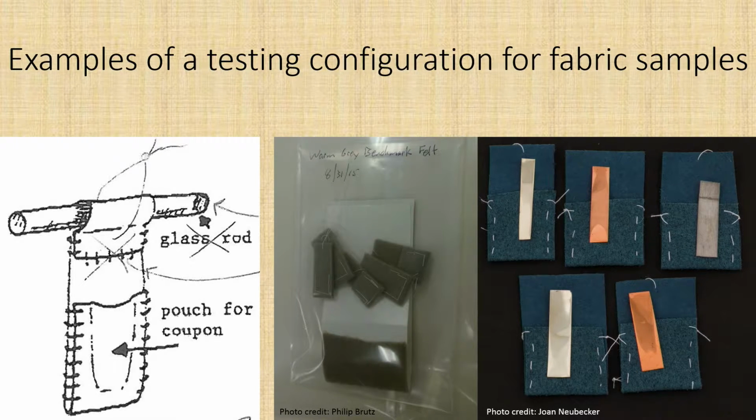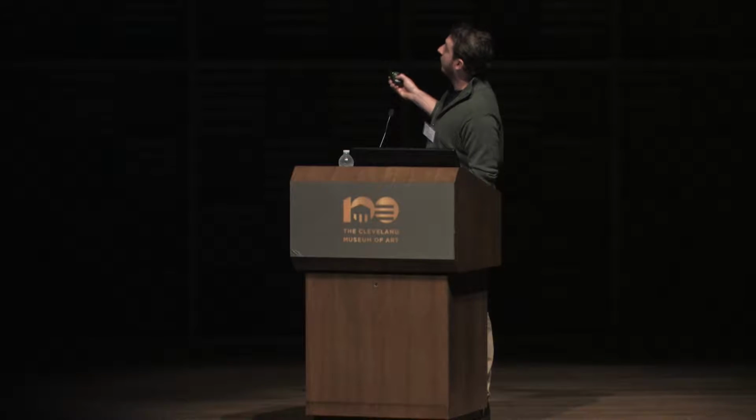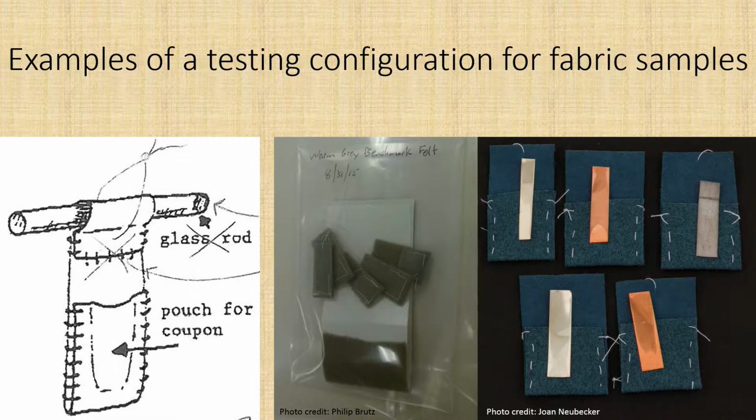The accelerated test includes copper and silver coupons. So in this, you see, these came from the ambient and these the accelerated. The ambient aspect takes place in a 500 milliliter jar with 25 milliliters of deionized water and is kept at room temperature for a length of time that's not predefined, but is at least 4 weeks. The ambient test includes copper, silver, and lead coupons.